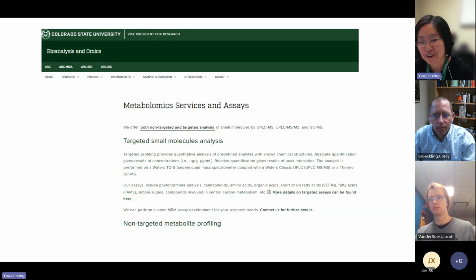I don't have a good number that I can back up, but I feel like at least 10 to 100 times. That's my feeling. My benchmark, for a comparable generation and model of instrument, is that 10 to 20-fold is probably a good rule of thumb. I see. All right. Thank you both.